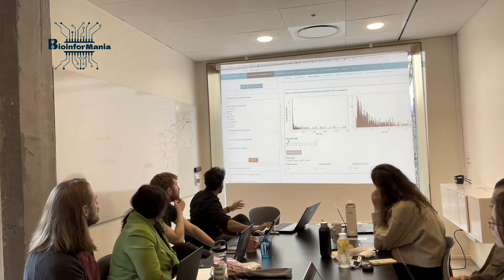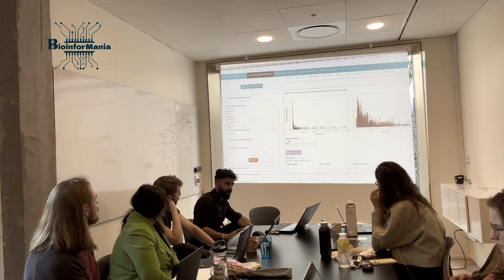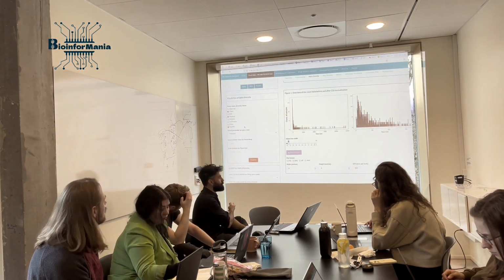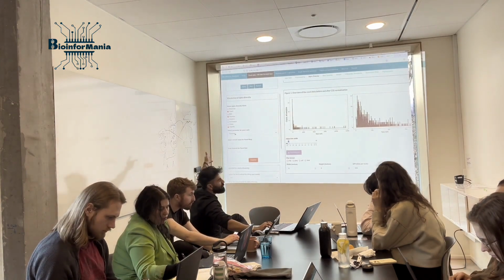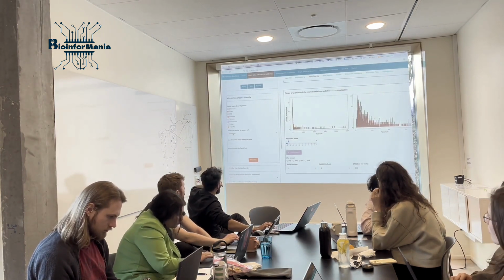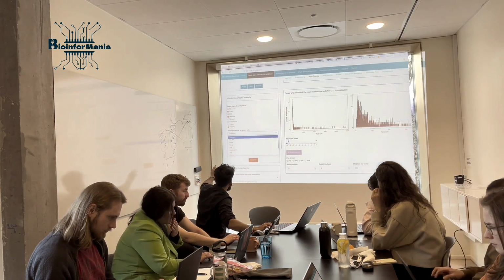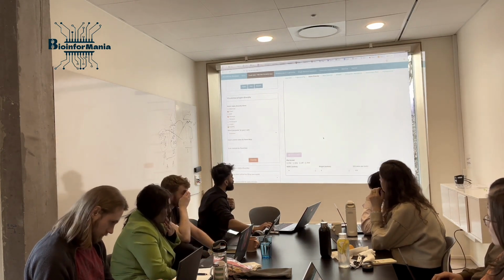First and foremost, I need to also add something: we have the phylogenetic tree here. So you can also take into account the phylogeny, phylogenetic-based diversity, which is Faith's phylogenetic diversity. So click on Faith, and let's just visualize our data. See how they look, okay? It automatically recognizes the header of your metadata. And then here, let's just visualize it on the treatment, because treatment is of my interest, okay?